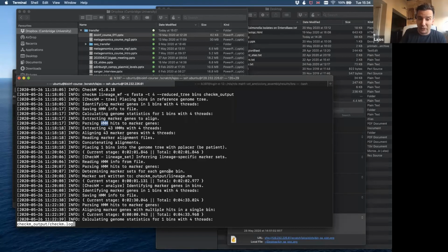Okay, and then as soon as it finds the HMMs, it will extract the amino acid and the nucleotide sequence from these known genes, and using the nucleotide or the amino acid, I don't know exactly which one, I think much more the nucleotide sequence, to align those and compare those sequences to its database.